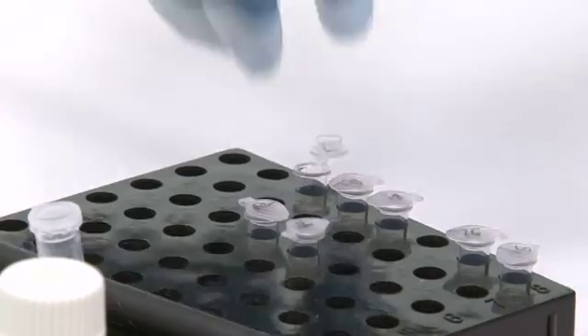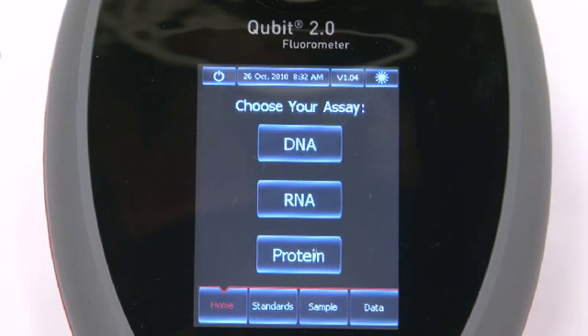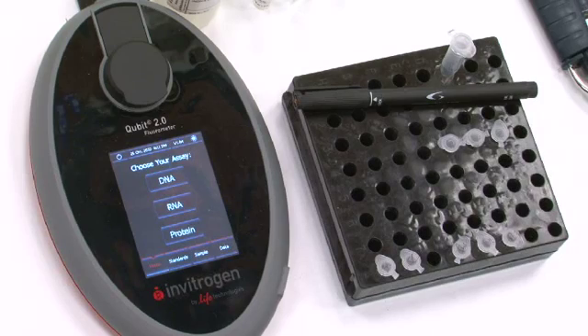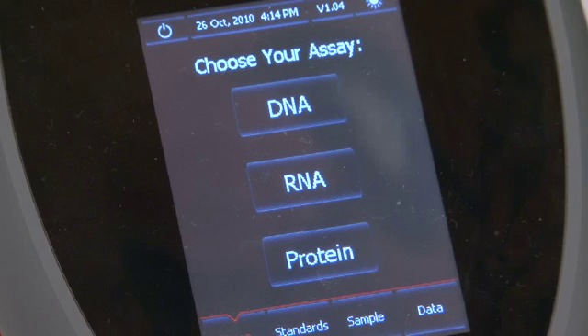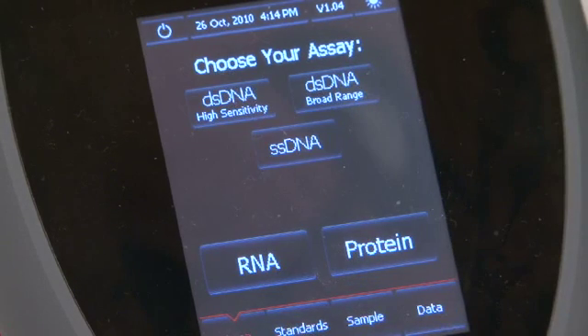We now have our 2 standards and 3 DNA samples ready to measure in the Qubit 2.0 fluorometer. On the home screen, you have a choice for DNA, RNA, or protein quantification. The Qubit 2.0 fluorometer has a touch screen — to choose DNA, just touch the appropriate area.